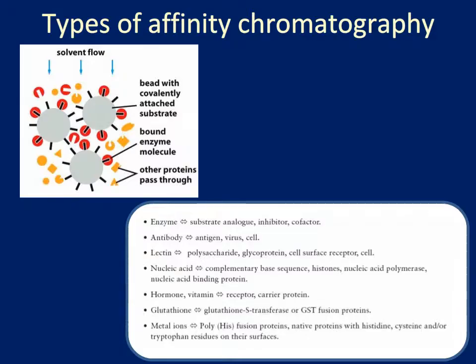In Affinity Chromatography, there are two partners: the protein of interest that you want to purify, and a molecule that interacts with that protein that is covalently attached to a bead of a specific matrix. The diagram on the top left is a schematic of affinity chromatography.